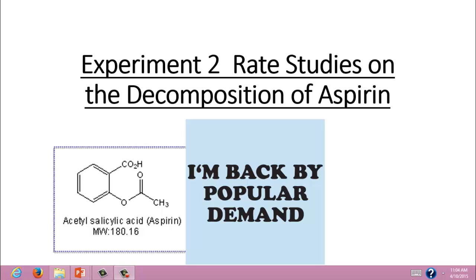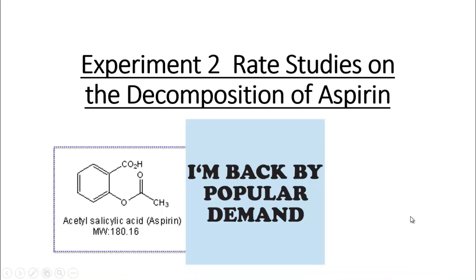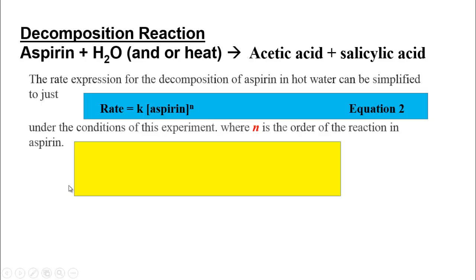What we'll be doing this week is going back to our old friend, aspirin, and studying the decomposition of a pure aspirin sample with respect to time. And of course, again, we're going to be looking at how aspirin, when we add water and heat, can get decomposed into acetic acid and salicylic acid.